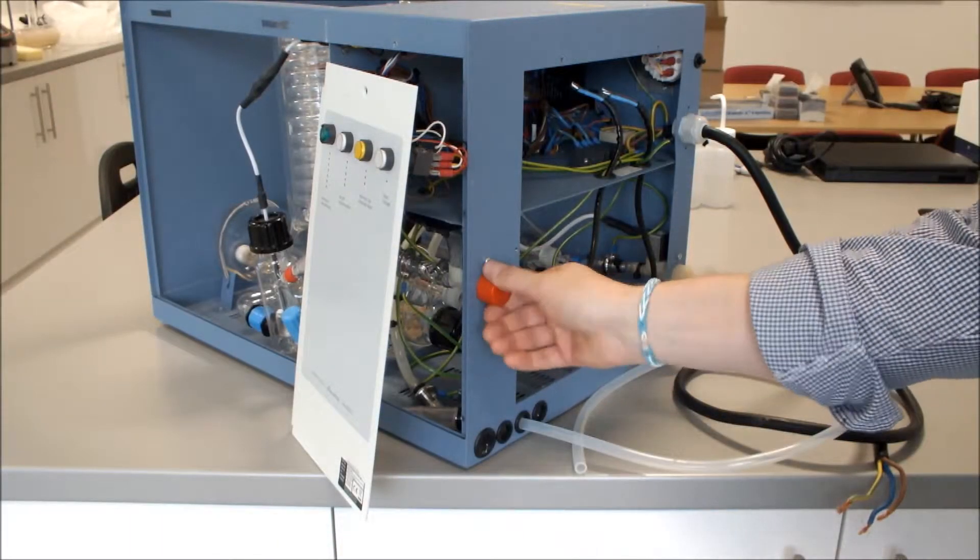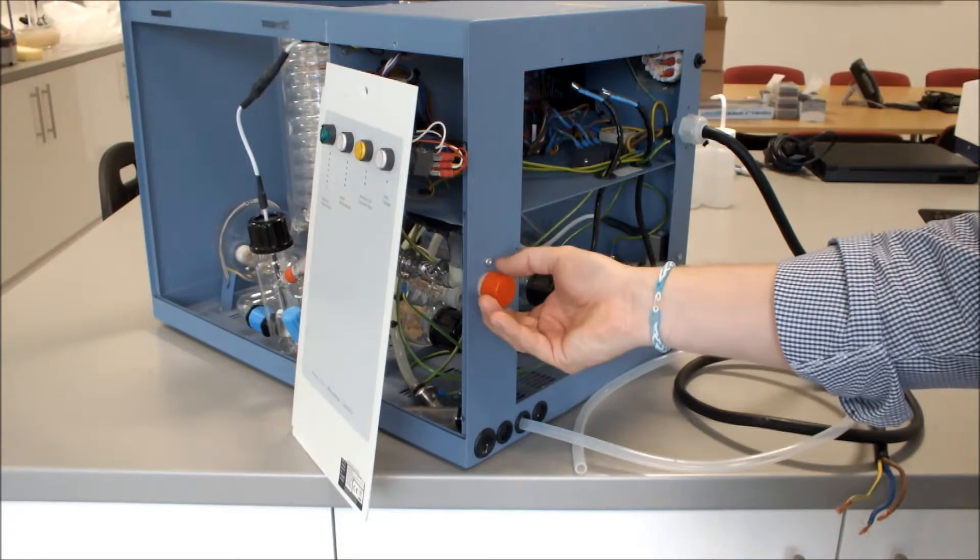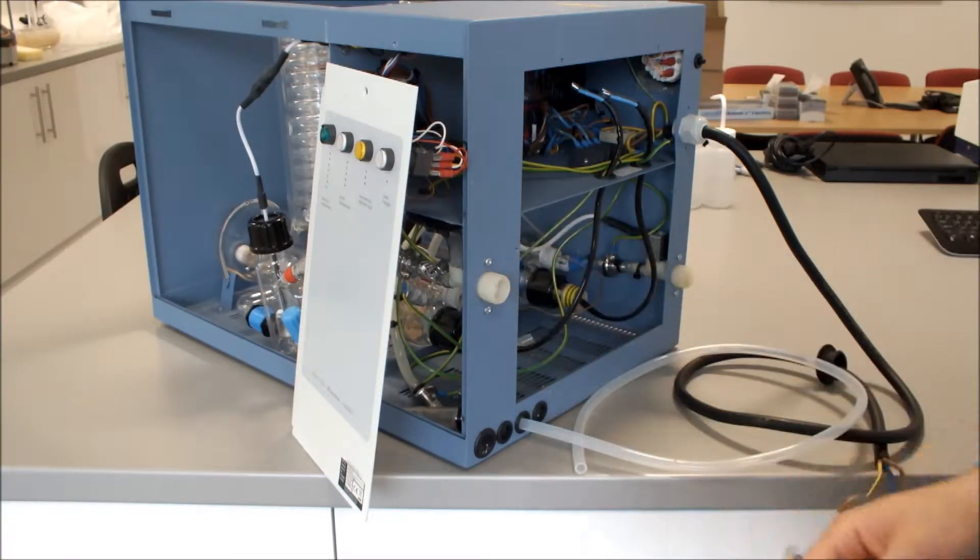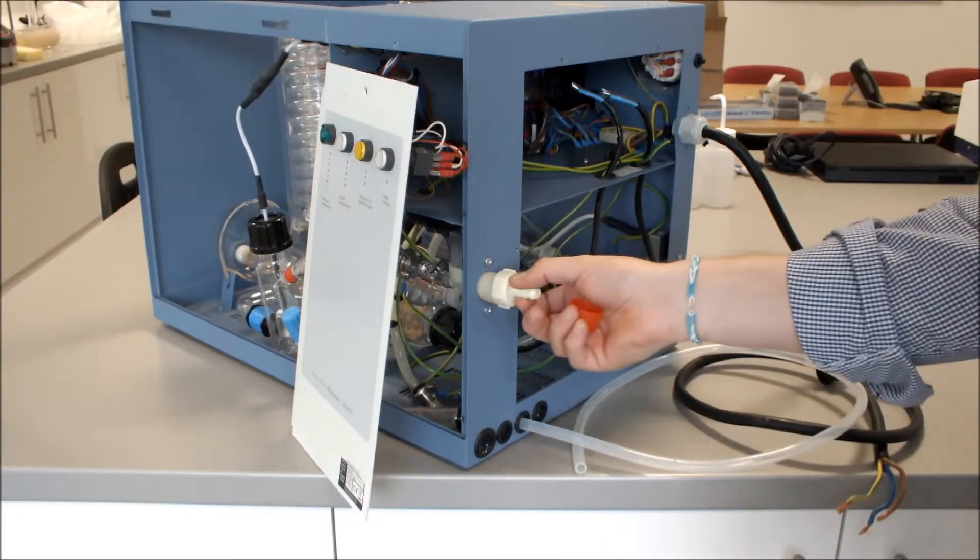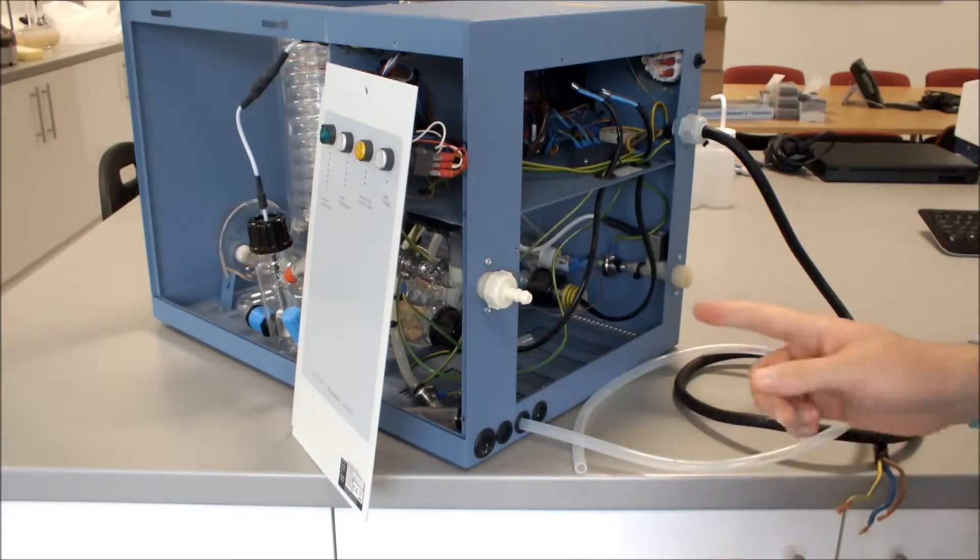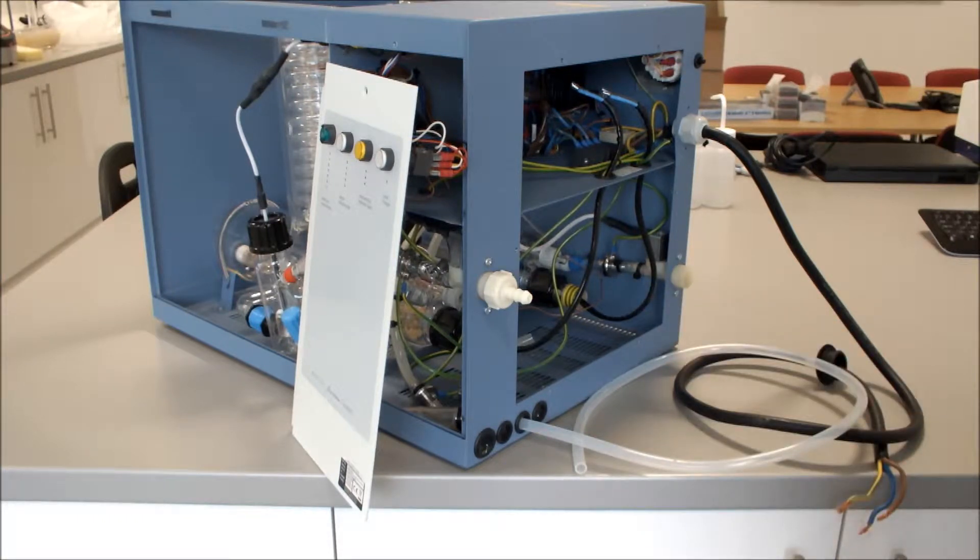We then remove the blanking cap from our deionised water or pre-treated water inlet. We then connect our deionised water. You can then connect your suitable tubing for your deionised or pre-treated water.